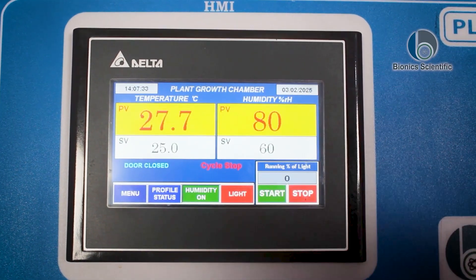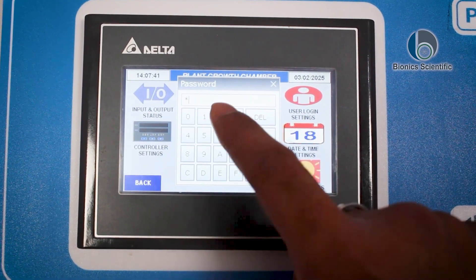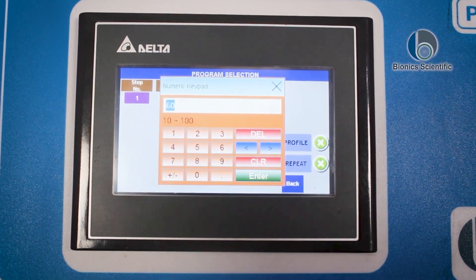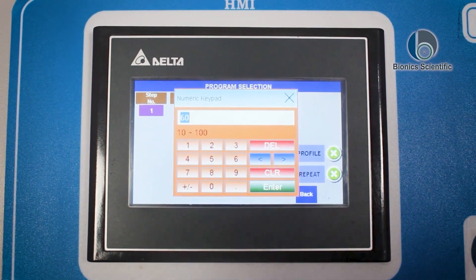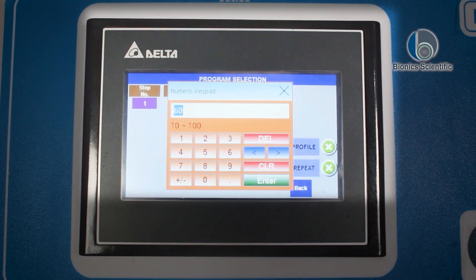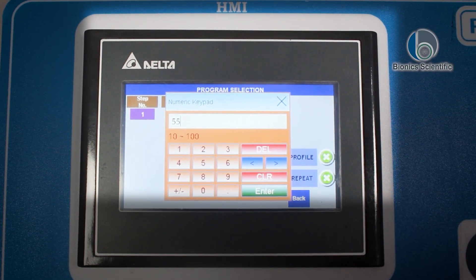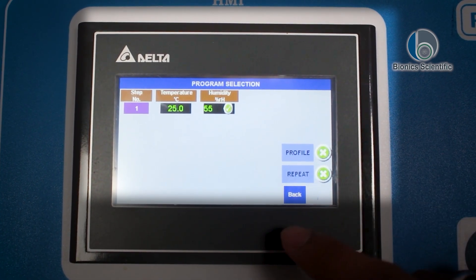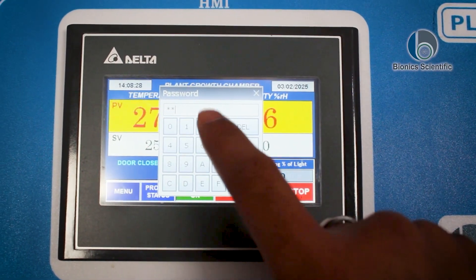You heard that sound — the machine is stopped. Now I'm going to the menu, cycle settings, entering password one, two, three, four, then enter. The humidity range shown is 10 to 100. I want to set it to 55, so I'll enter 55, press enter, go back, back, then start — one, two, three, four.